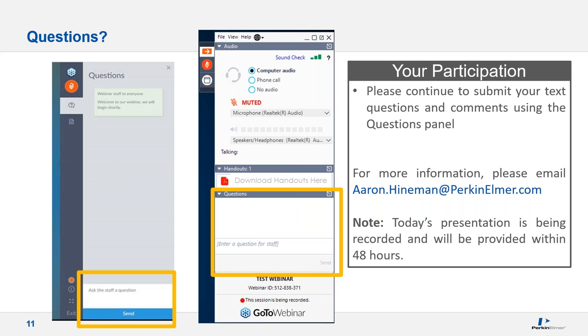I've never done that, so I can't talk about it specifically, but I would use those same strategies. I would run a single element uranium standard, and then look at your other analytes in your method and see where the interferences are, and what you can do with them. Another option, if you have an Avio 500, is to use the universal data acquisition, because it'll let you add just about any element or any wavelength that you want. So say you're seeing uranium interference on, I'm just making something up, cadmium. You could then run UDA and put all 53 cadmium lines in, reprocess, and see which ones uranium will interfere with and which ones it will not.